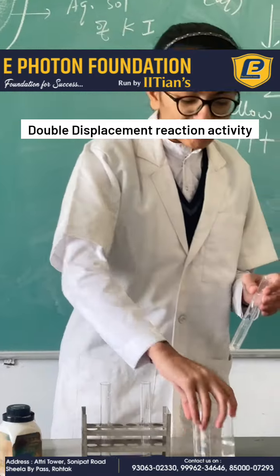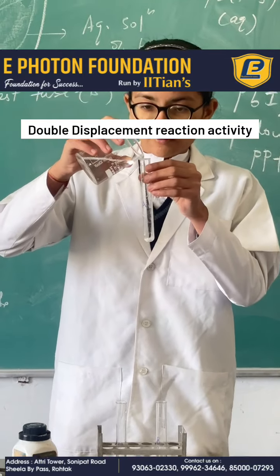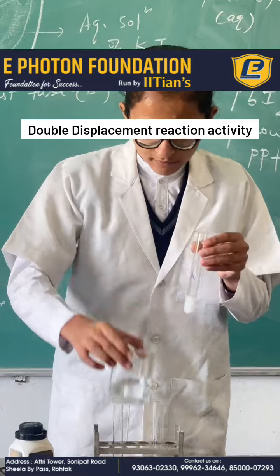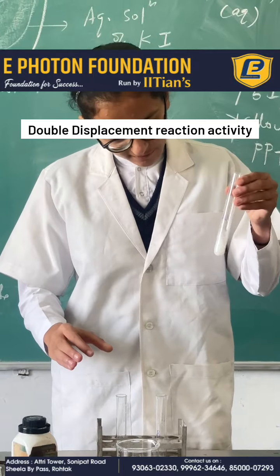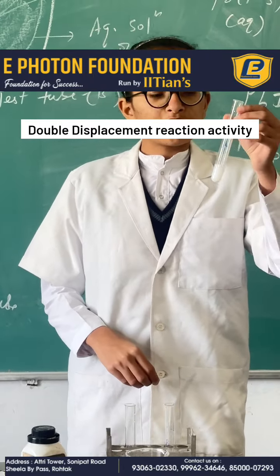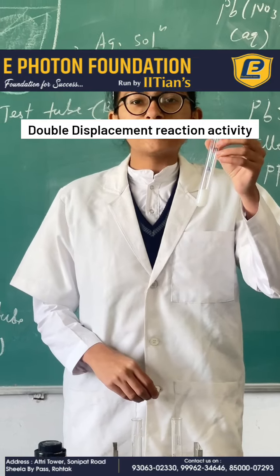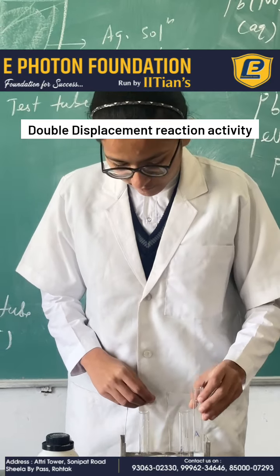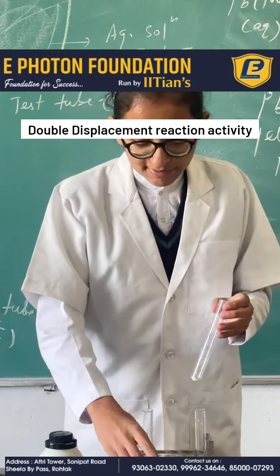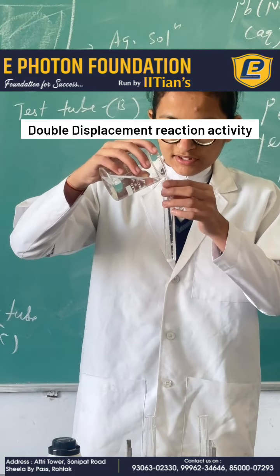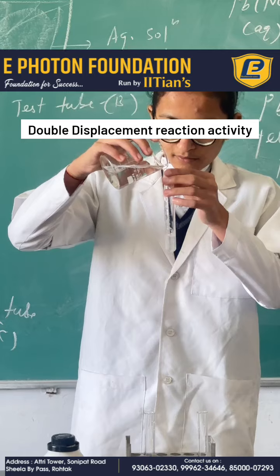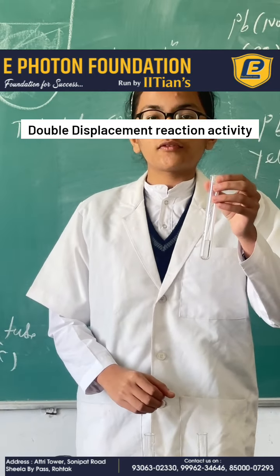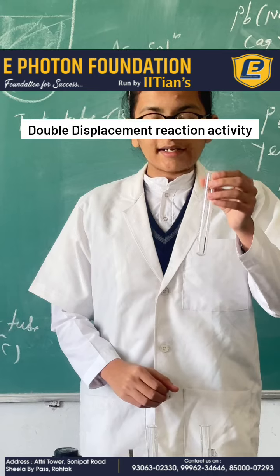Now add some amount of water in test tube A and mix it. We observe that the color of the aqueous lead nitrate solution is white. Now add some amount of water in potassium iodide, and we observe that the color of potassium iodide solution is colorless.